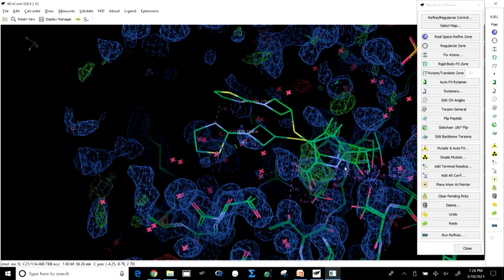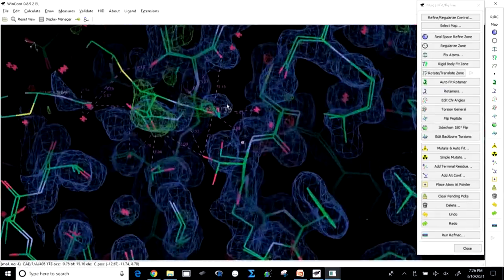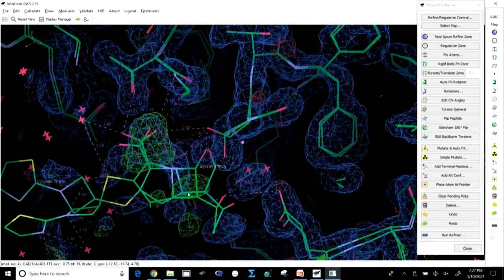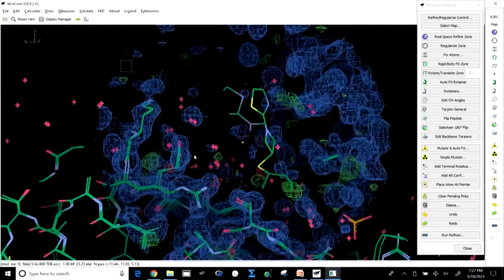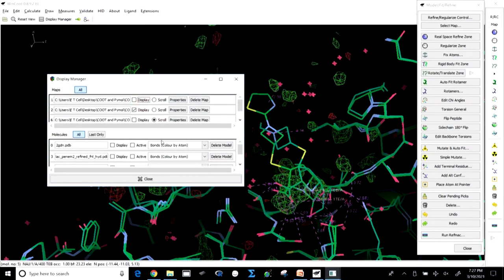But now, if you look at this, you clearly see that for the one structure the 4-membered ring is intact, whereas in the other structure the 4-membered ring is broken. If for some moment, to make it more clear, I take out this, you will clearly see this now.